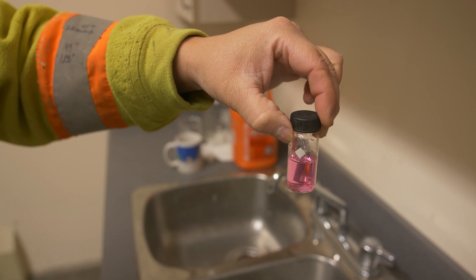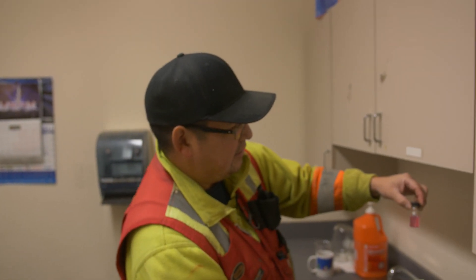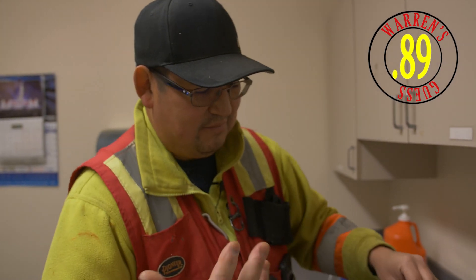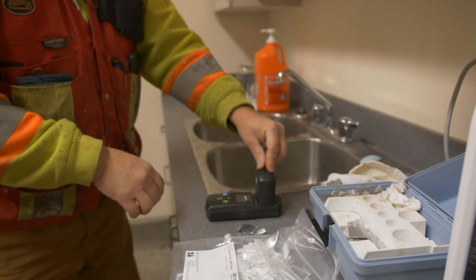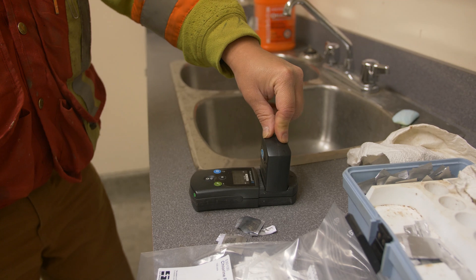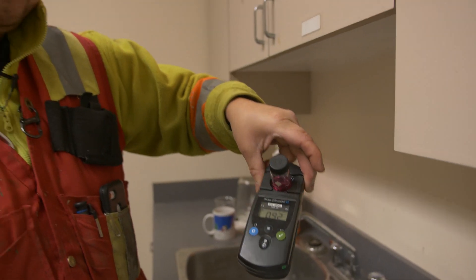One of the fun things I like to do with myself and my other operators is sort of guess. Okay, we're probably sitting — my guess — let's say 0.89. We'll throw our guesses in and see who is closest. Cover that, push the green button to check. Wow, that was close — 0.92. So I said 0.89, we got 0.92. That's the water operator's version of fun, I guess.